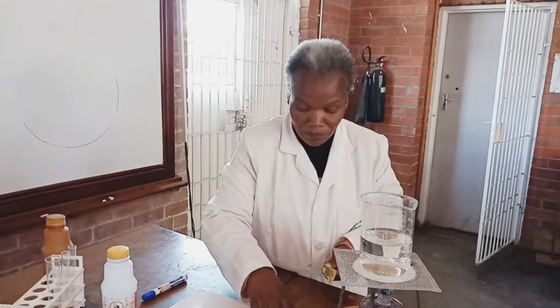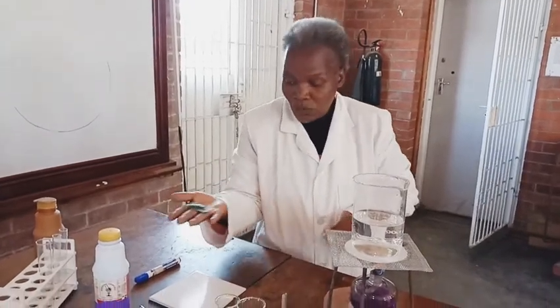We now want to do a very simple test. Remember when we looked at nutrition, we said for us to make sure that photosynthesis is okay, we must be able to test for the products of photosynthesis. So today we want to test these leaves which I have here. We want to test them for starch.